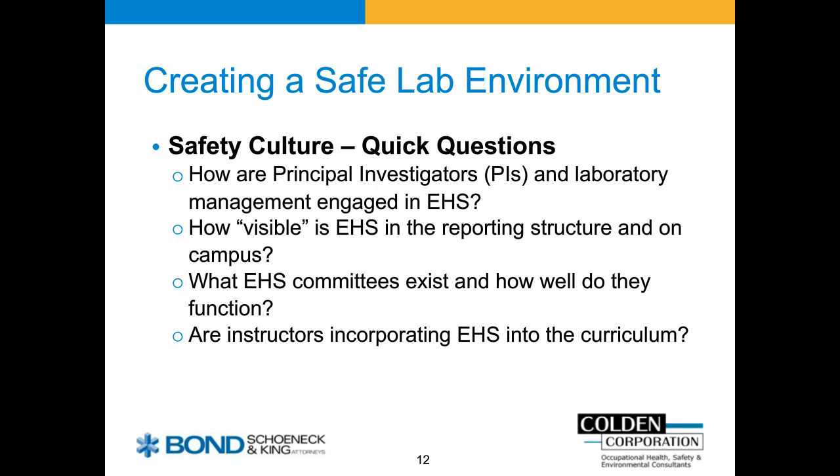Then we ask, what EHS committees exist and how well do they function? Is it people getting together? Are they putting anything out? What does their charter look like? What have they been charged with? Who gets invited to those meetings? We'll review the minutes of these meetings and examine the deliverables to see how much impact they're having. I can tell you that for my higher ed clients, when they have well-functioning, targeted committees, they can really be a savior for frankly an understaffed higher ed EHS department.